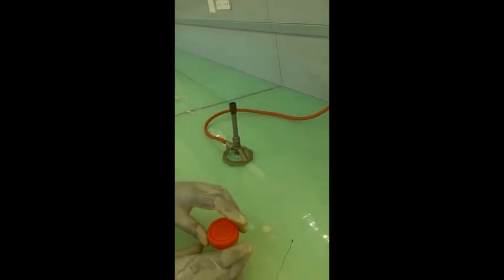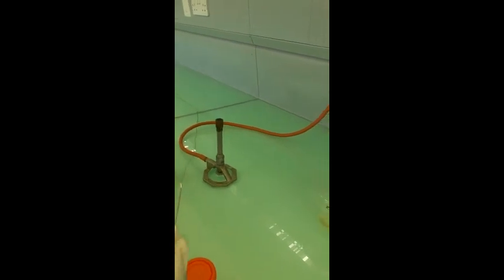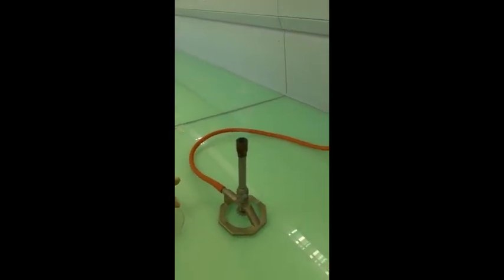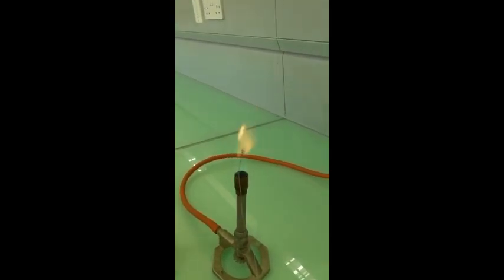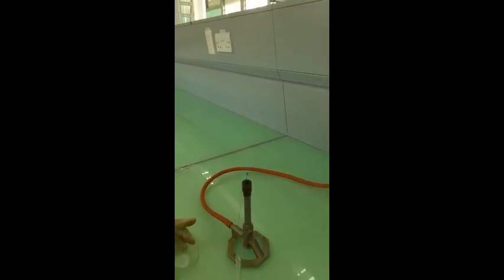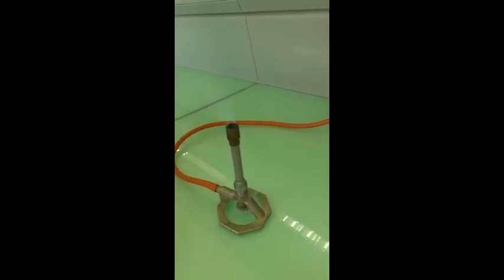We proceed to our next sample, which is a compound of barium. We've already cleaned our rod — we'll try that again with the sample.